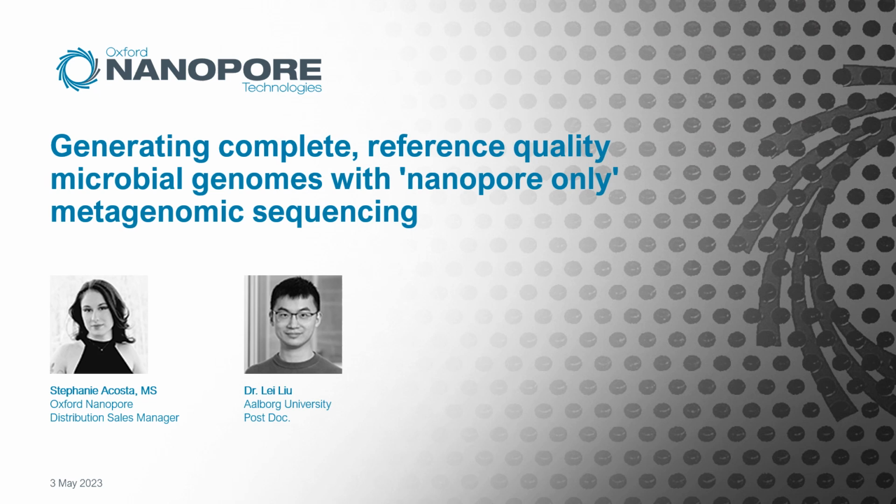Thank you, Maria. Recent advances in nanopore sequencing mean it's now possible for any lab to generate reference quality microbial genome assemblies without the requirement for short reads or reference polishing, saving considerable time and cost. In this webinar, Dr. Lei Liu from Aalborg University will share his experience utilizing nanopore-only long-read sequencing to generate complete high-quality genome reconstructions from complex metagenomes.